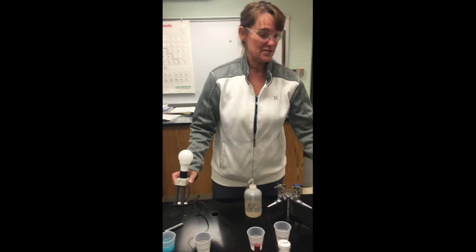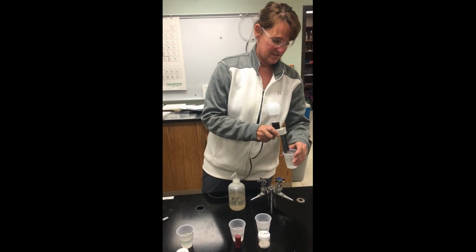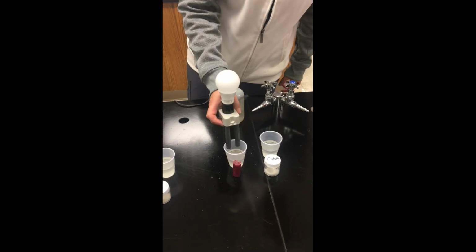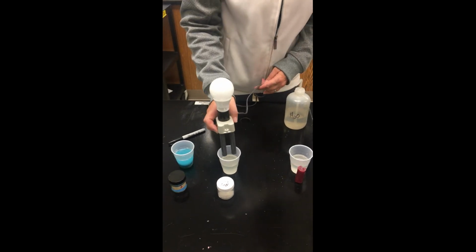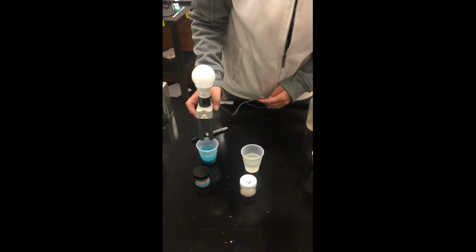So let's do this just really quickly. Once again, I gotta rinse this off. Okay, we have sugar water, nothing. Candle wax, nothing. Salt, NaCl, light. And copper sulfate, light.